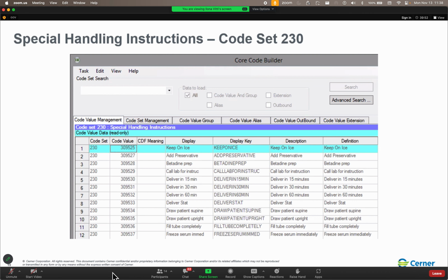This one, you can go ahead and append to existing requirements or replace existing requirements. With the advent of Bedrock, I don't see this used very much anymore, but it is an option.